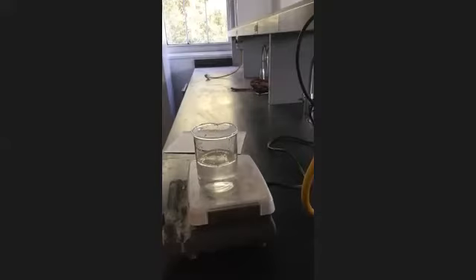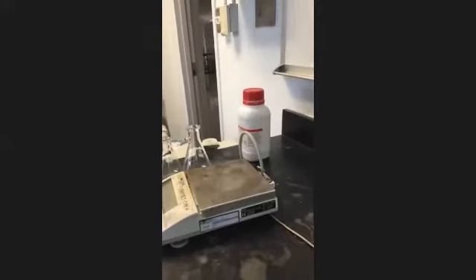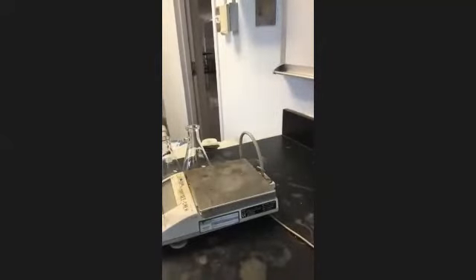All right. So we're gonna heat that up, and while that's heating up, we're gonna come over here to the balance. Yeah, put it on about 5. What are you working with? You got one of those white and gray ones? Yeah, put it on about 5. All right, so we got the balance. We have salicylic acid, which is right here.